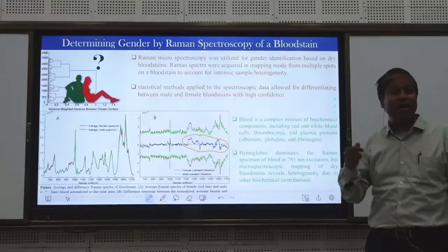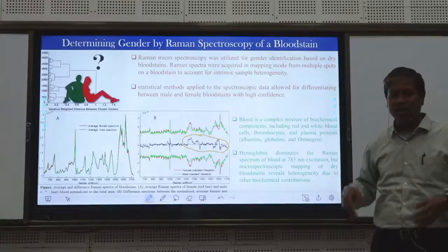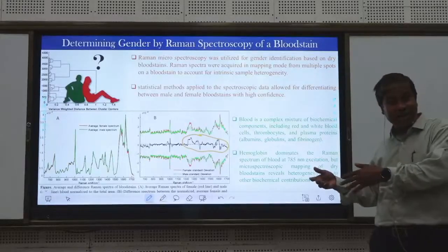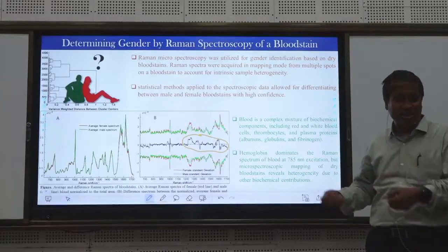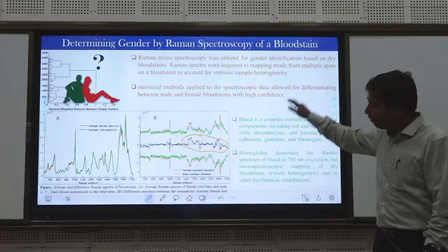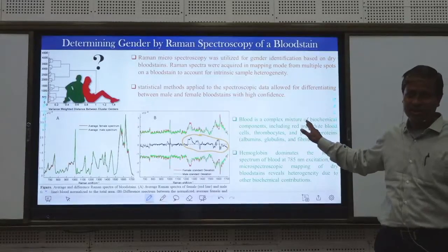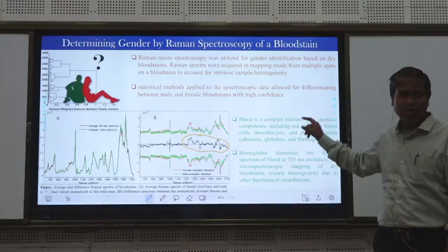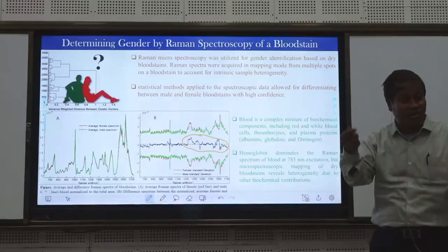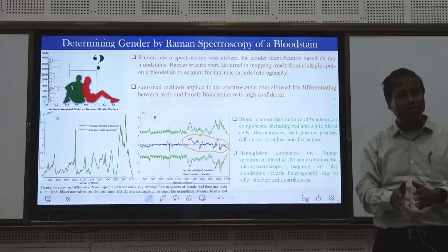If it is human blood, whether it is peripheral blood, meaning blood circulating in the body, or menstrual blood, or animal blood, or synthetic blood. You will see that so many kinds of studies are there, and for each of these studies they have done lots of statistical analysis, because at the end of the study you have to tell the government that your report is a convincing one.